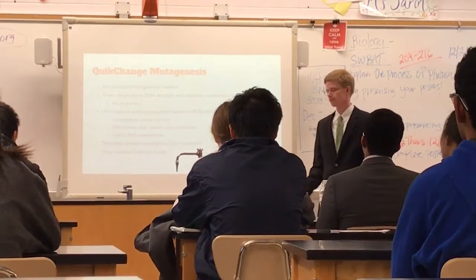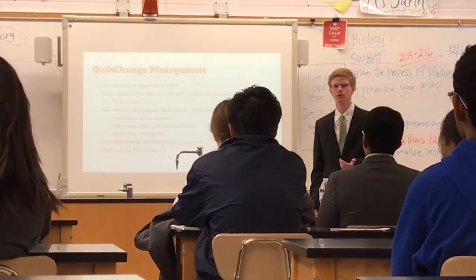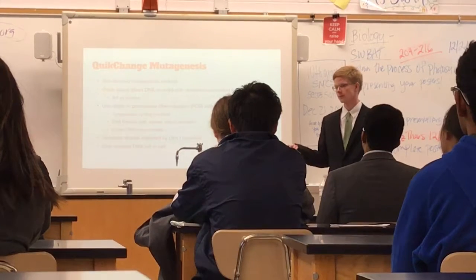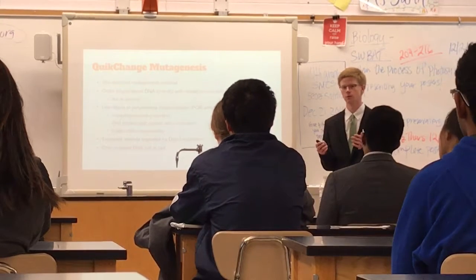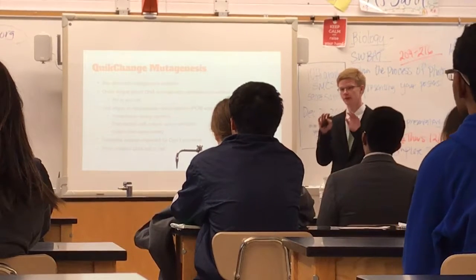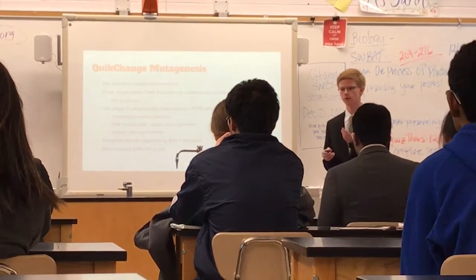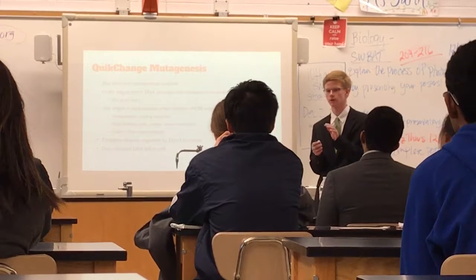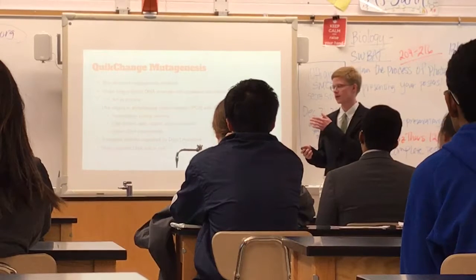So to carry out this mutation, I used the site-directed mutagenesis method. And the first step in this is to order oligos. Oligos are just short strands of DNA with a specific sequence. And this sequence for this mutation is going to match the DNA almost perfectly, but in the center, it's going to have a few deoxyribonucleotides modified to be the mutation that you want to get in the result. And these act as primers.